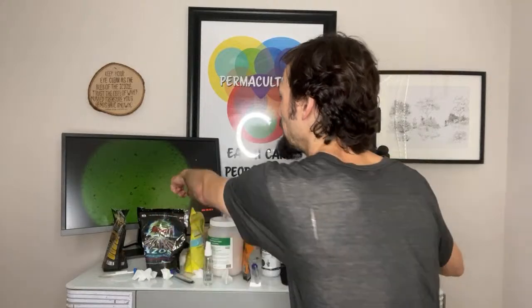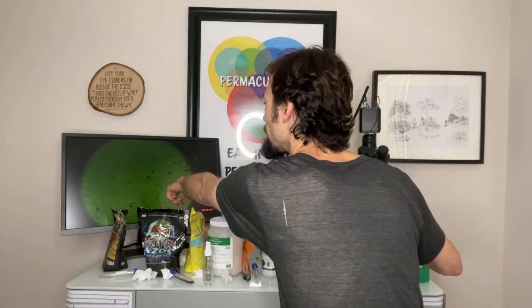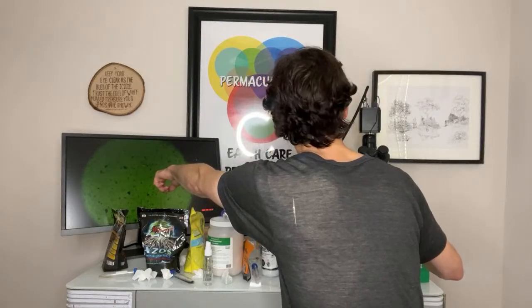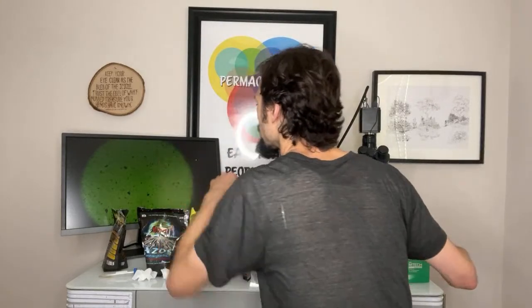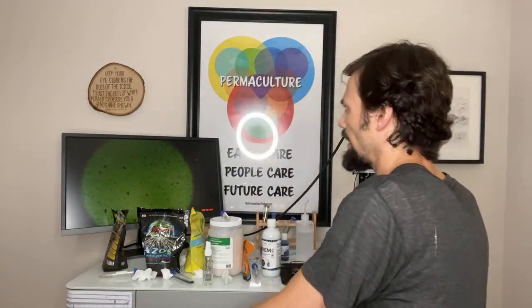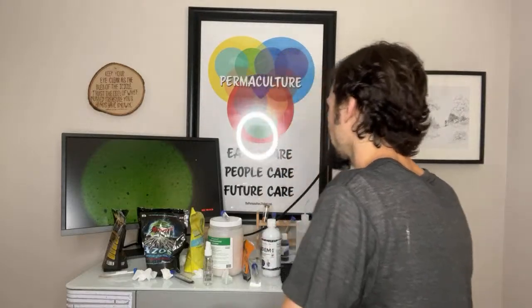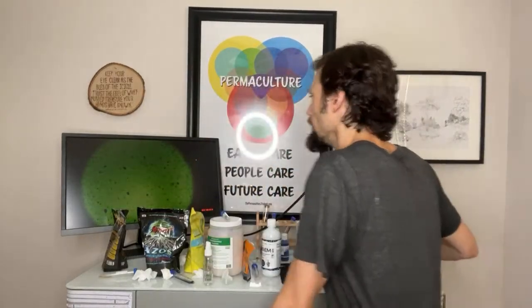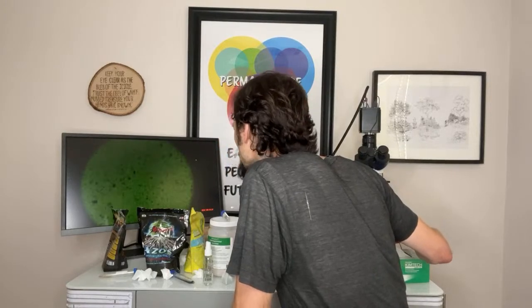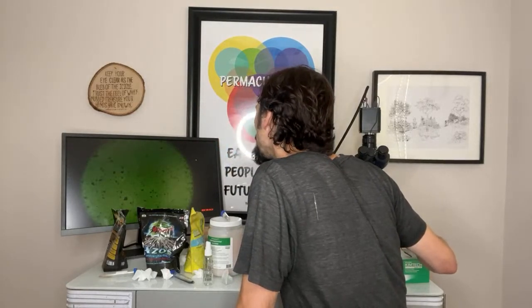Yeah, so that piece is right there, and I can see it even at 100x. It's all lit up. There are all these other organic matter chunks that are not lit up. Sorry, I'm having to crane around. But let me move around and see if I can get another one, because that was visually unbelievable.